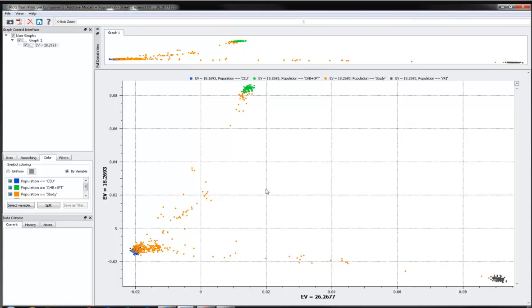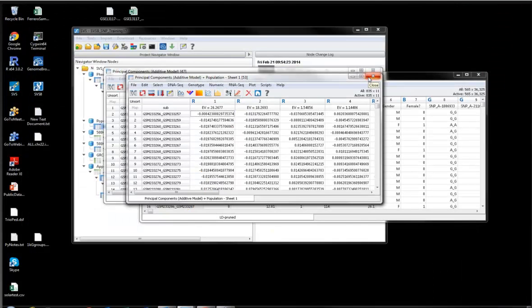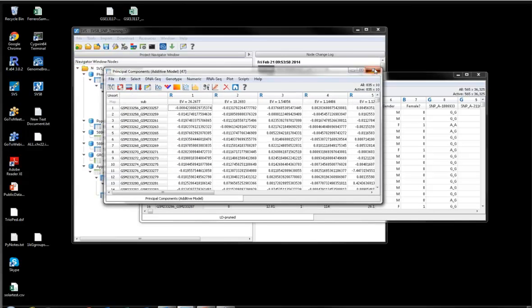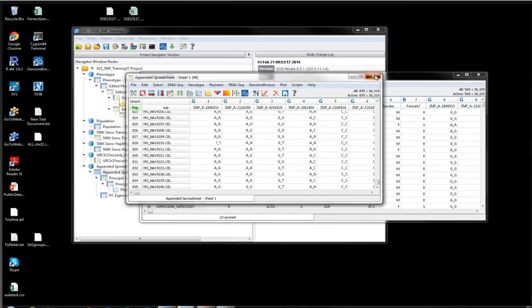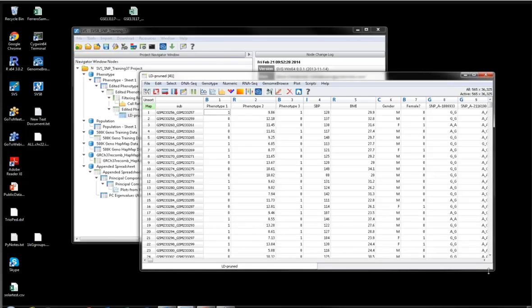and we'll need to be aware of that as we go forward. If you want to drop samples based on these patterns, there are options for outlier removal based on principal components analysis. I won't go into that too much here today. But also, the mixed model analysis that we're using is really quite good at accounting for population structure and stratification. So we'll see how that works out.